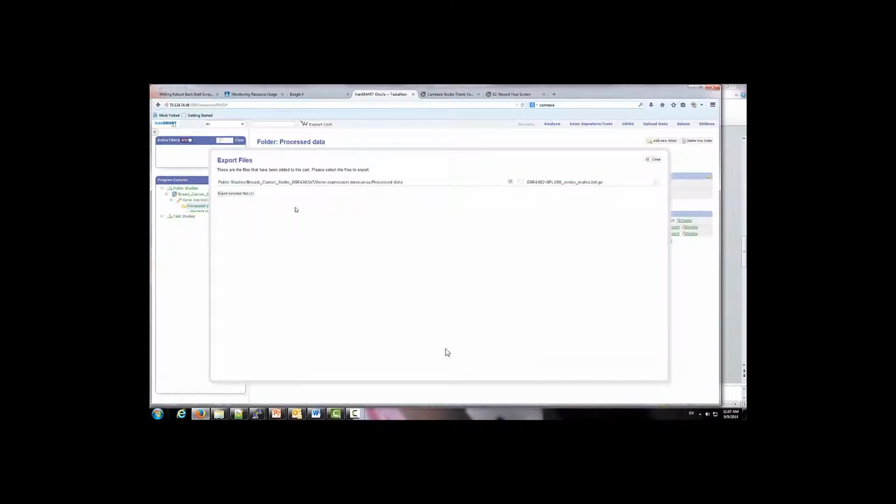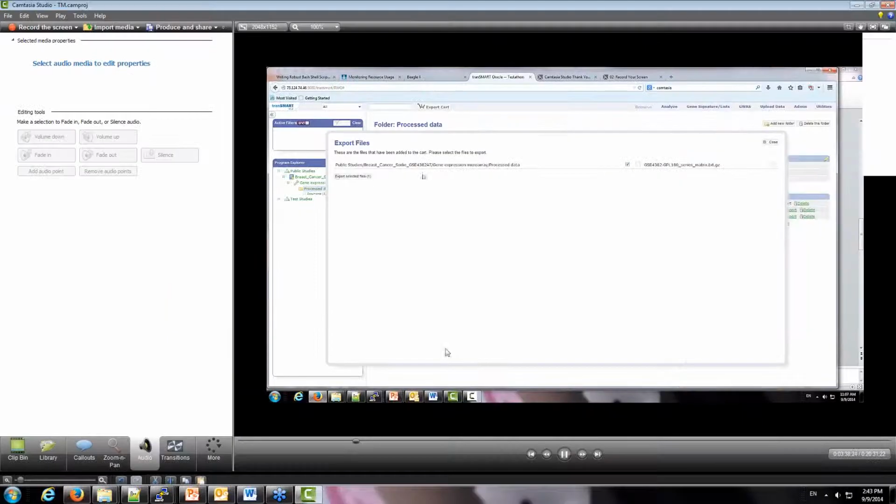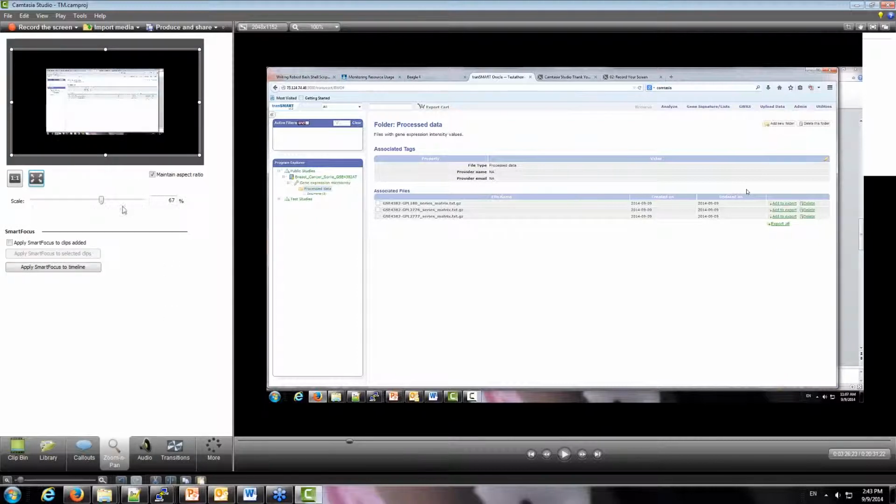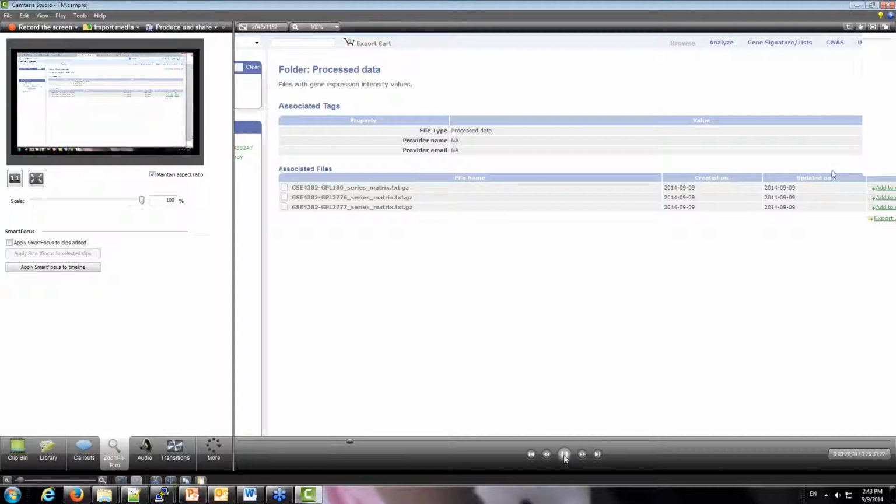Clicking the study node displays the related information for the study. Similarly, the power users have the ability to add analysis, assays, or folders. And there is an analysis node under this study node, and the users can add new folders or delete assays under this node.